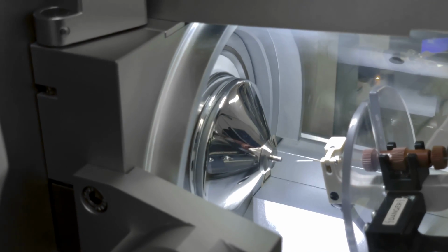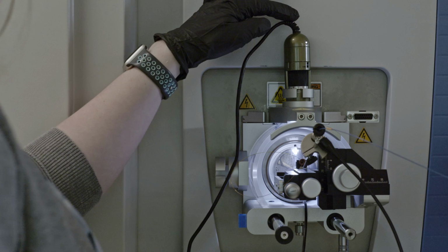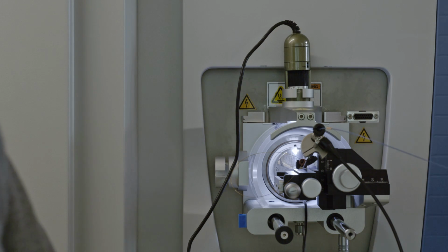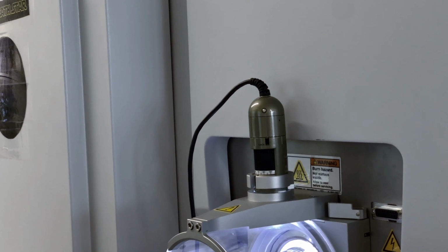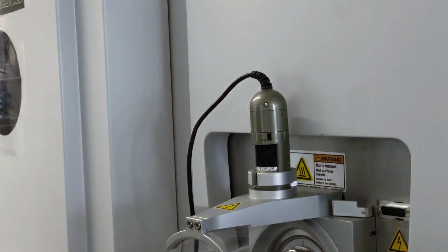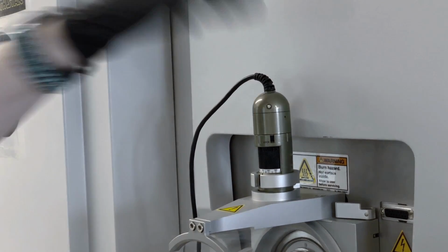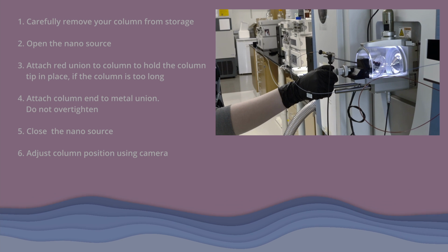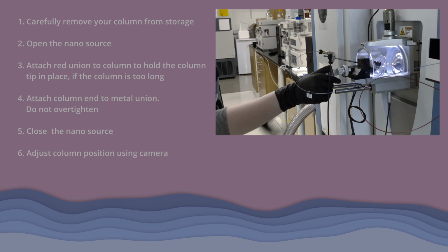Until the column is closer. This here is actually a camera which feeds into the computer so we can look at the positioning with a program at the computer. To turn the light of the camera on and off, you can push this button here, and again to turn it back on. So you want to adjust the column forward until it's close to the ion transfer tube, right about here.